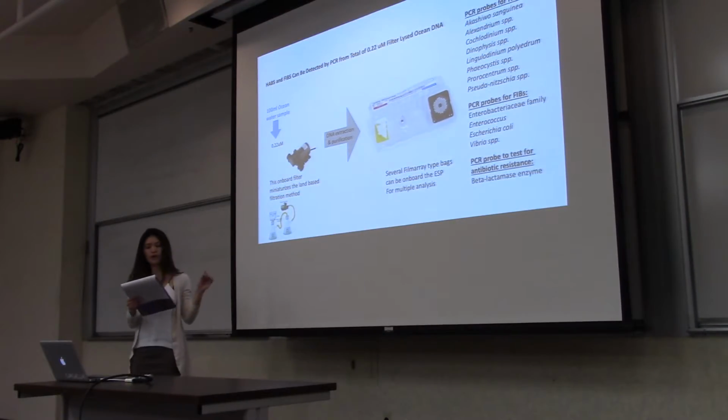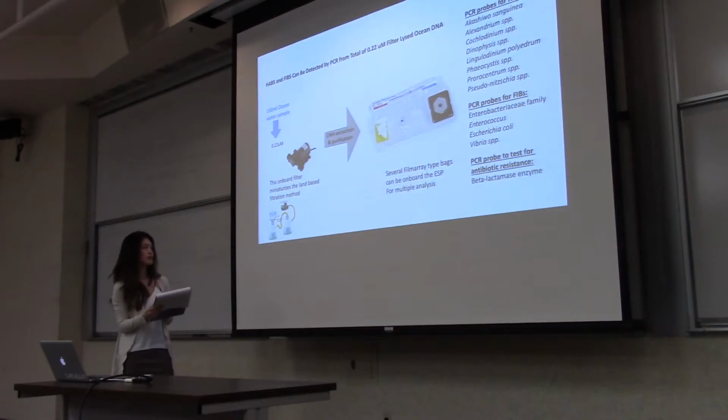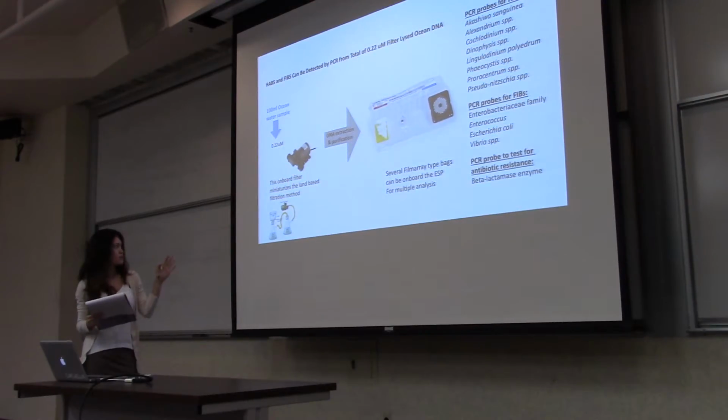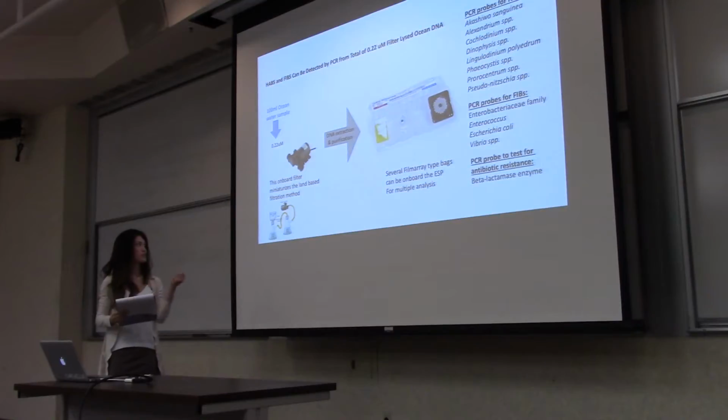A 0.22 micrometer filter will be incorporated into the onboard filtration device, which is this one. And this onboard filtration device miniaturizes the land-based filtration method used by our lab and also by the national standard government.